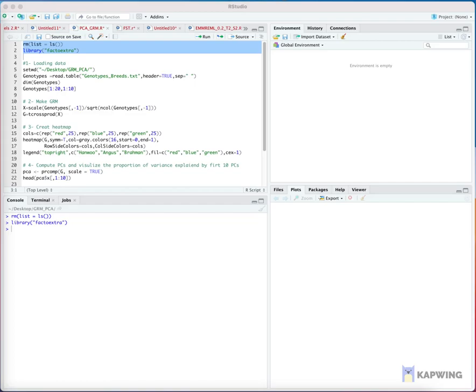Step 2: Read genotypic data from 3 dairy cow breeds — Hanwu, Angus, and Brahman — each with 25 individuals, genotyped for 7,763 loci.